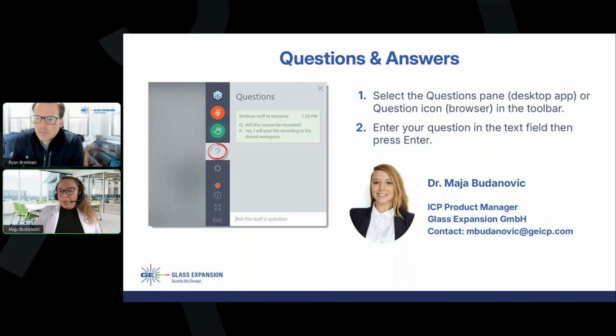Okay, for the sample probe, usually what is enough for cleaning is just using the online cleaning method, which is starting and finishing your analysis by aspirating and introducing blank solution, for example, for 5 to 10 minutes. And then you would also rinse it with ultra pure water or deionized water for 5 to 10 minutes. So that's the so-called online cleaning that should usually be enough.